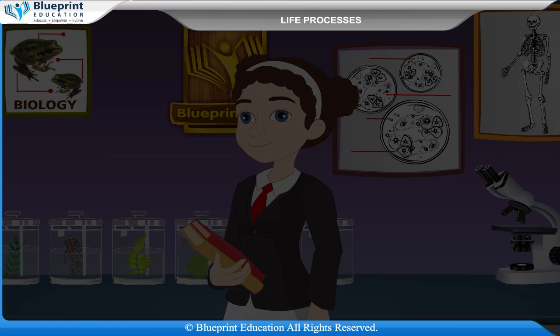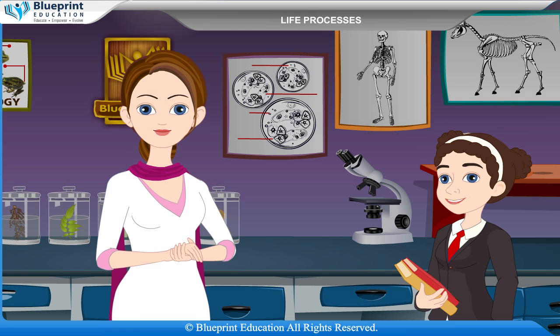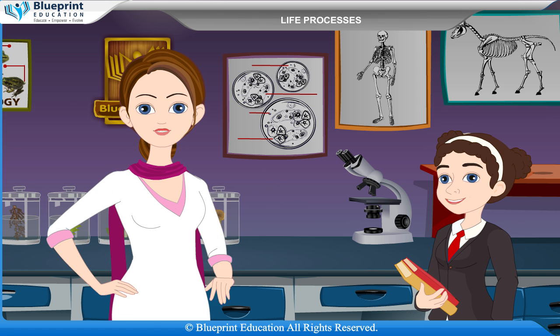The opening and closing of stomata is mostly controlled by the turgidity of guard cells and presence of potassium ions. Exchange of gases and water vapors between the atmosphere and leaf is the main function performed by stomata. Let's do an experiment to prepare a temporary stained mount of a leaf peel to show stomata.